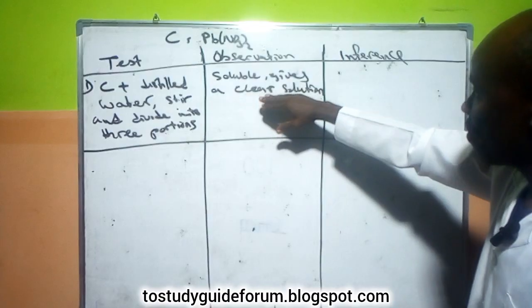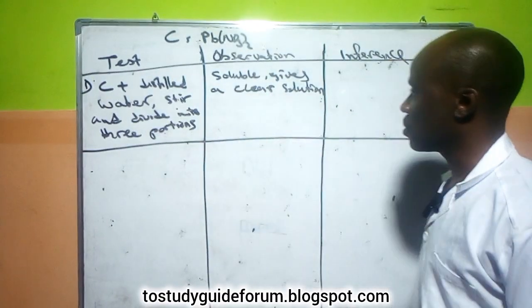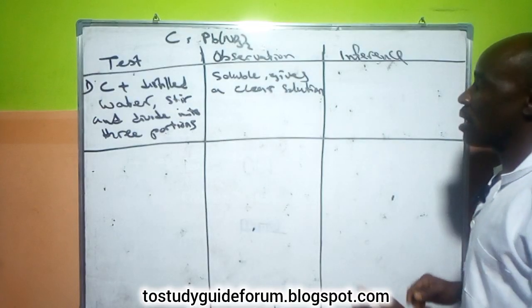Since we don't have something like that, this portion does not have any transition ion in it.